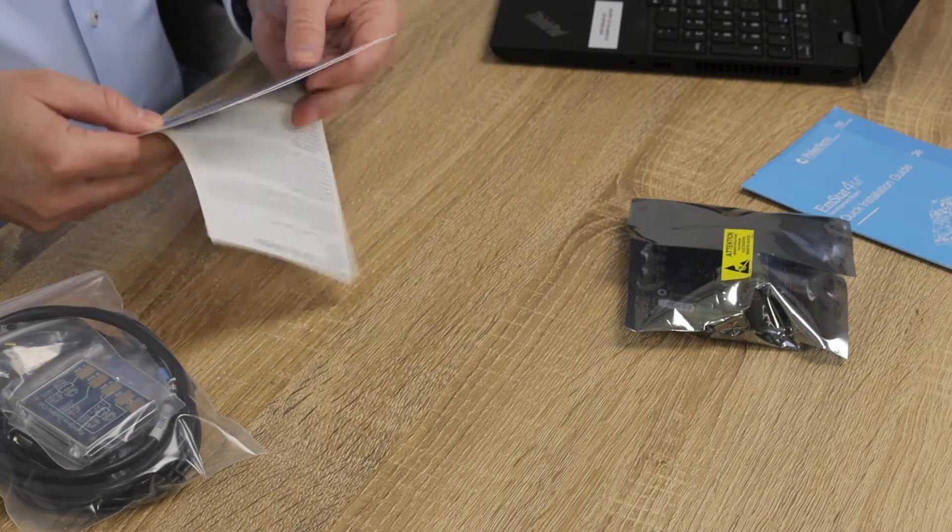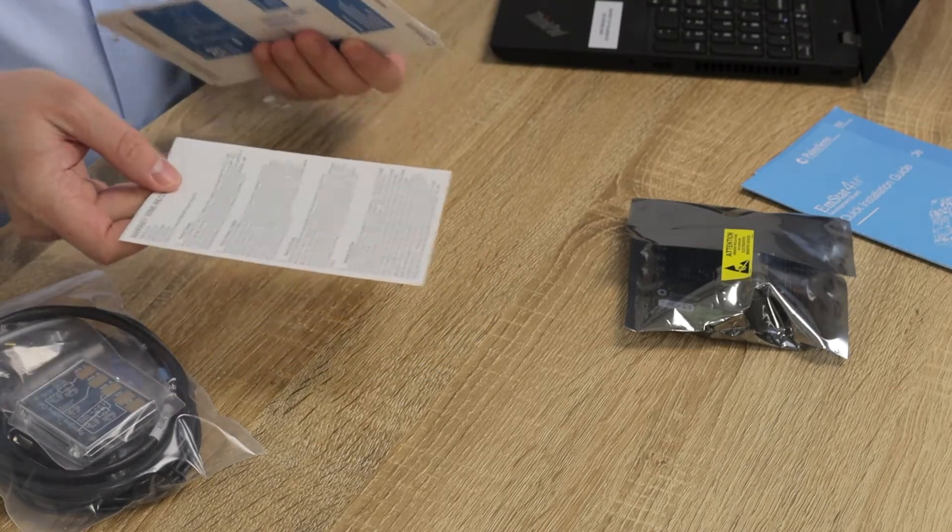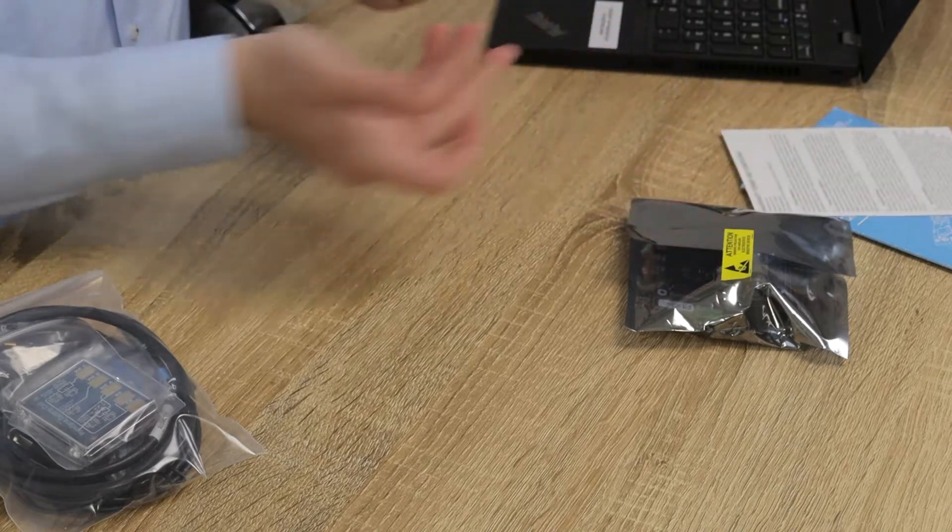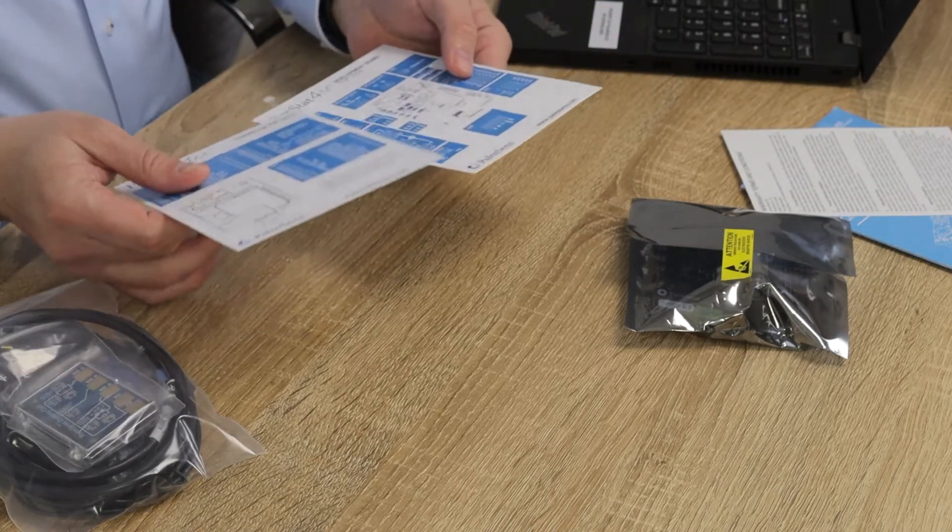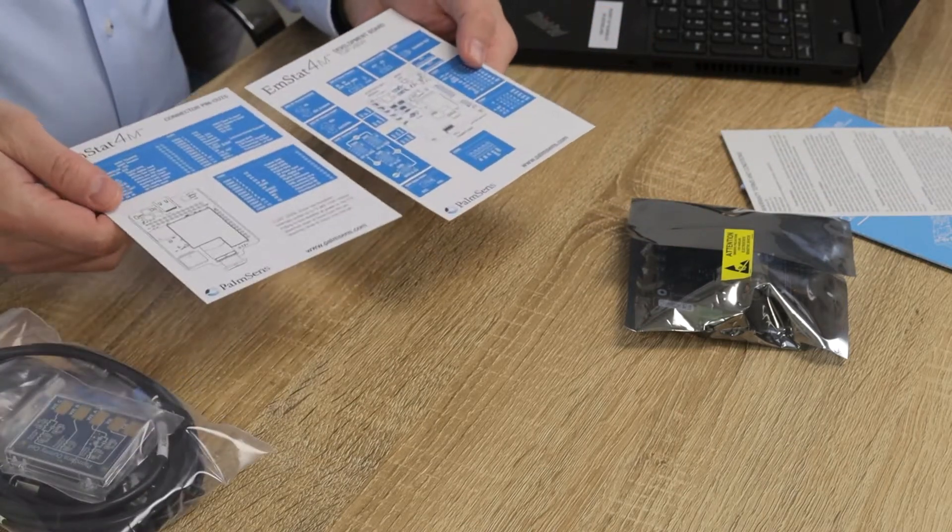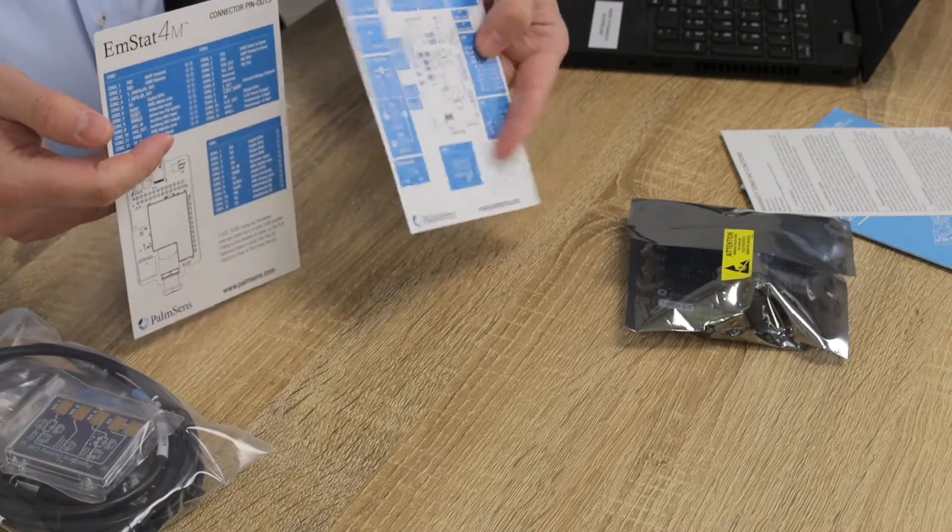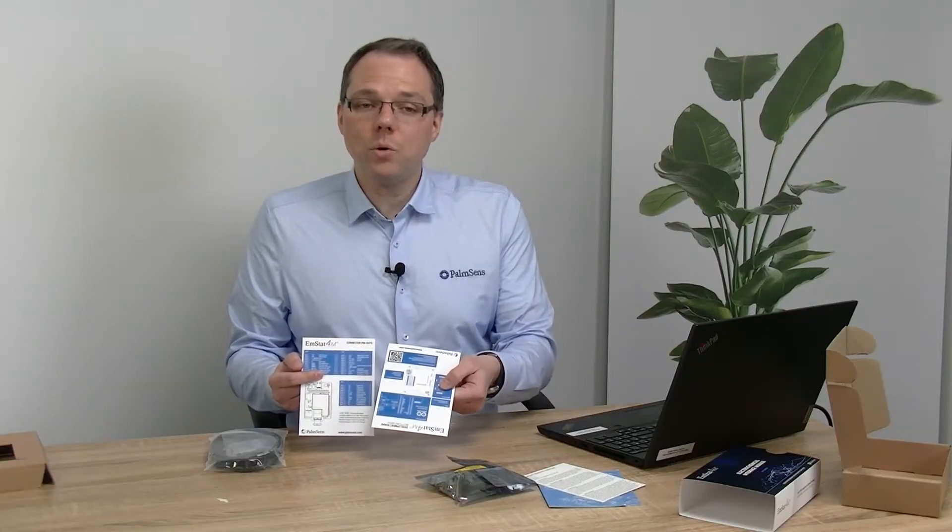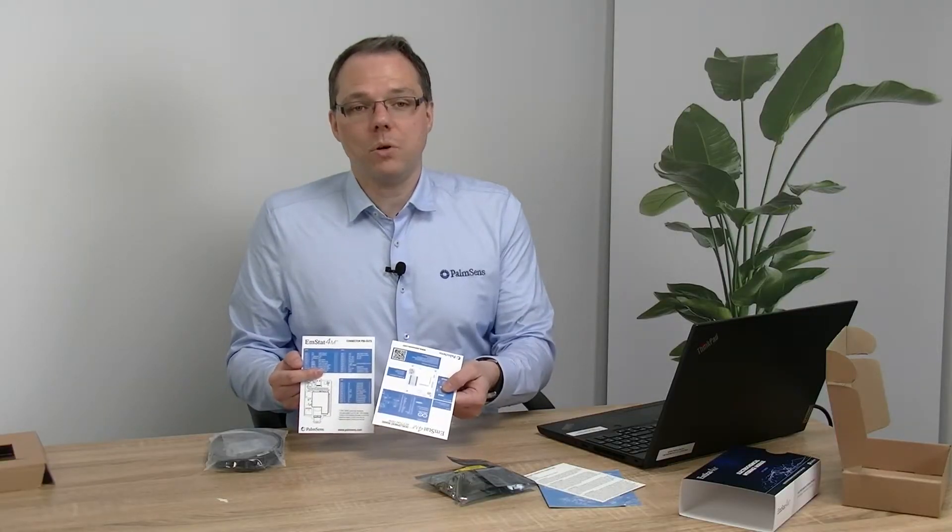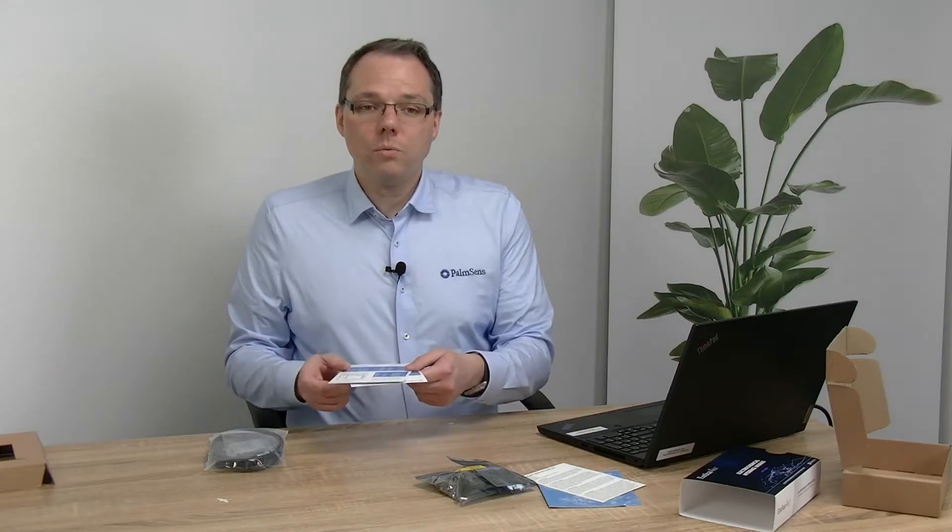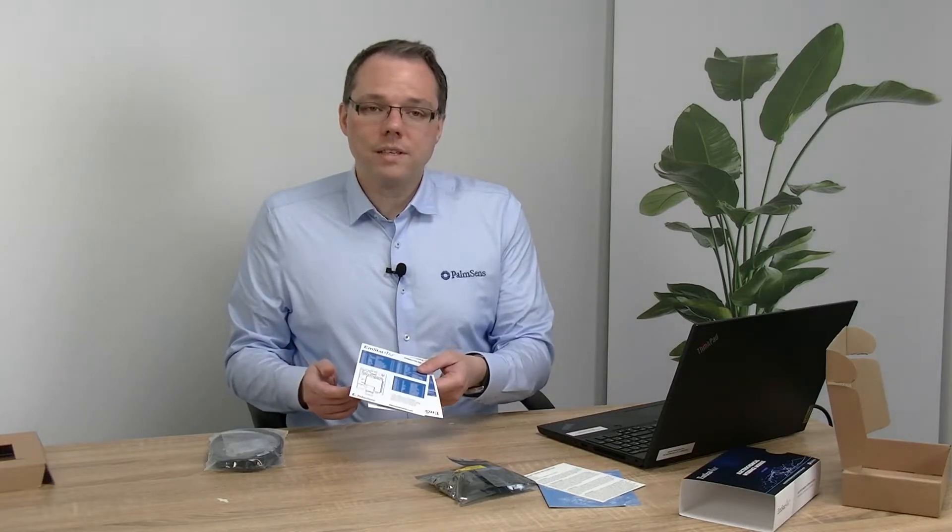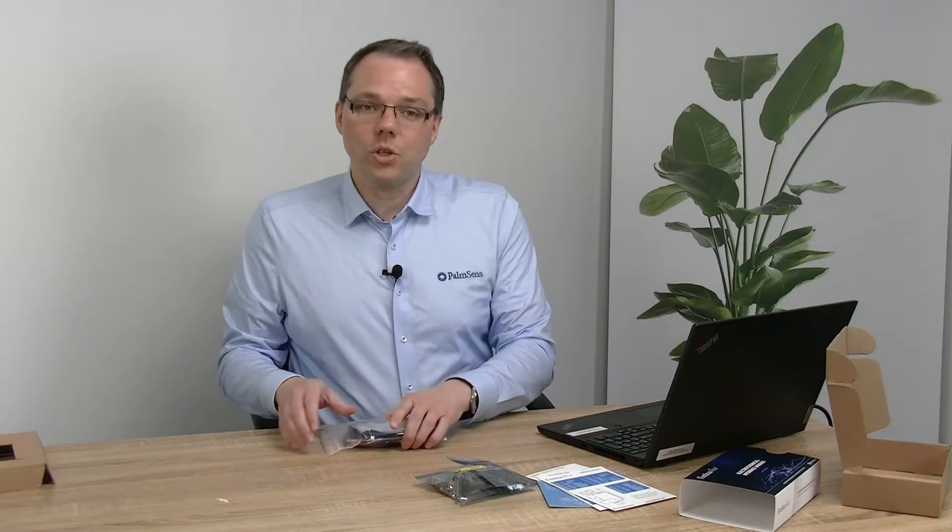Also we have here the warranty terms and conditions. We have here two cards with schematics of the development board and the potentiostat module itself, so when you want to do your own designs you know what each of the connections on the boards and potentiostat module do.